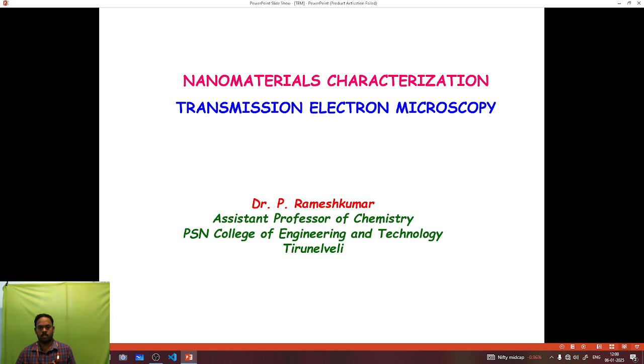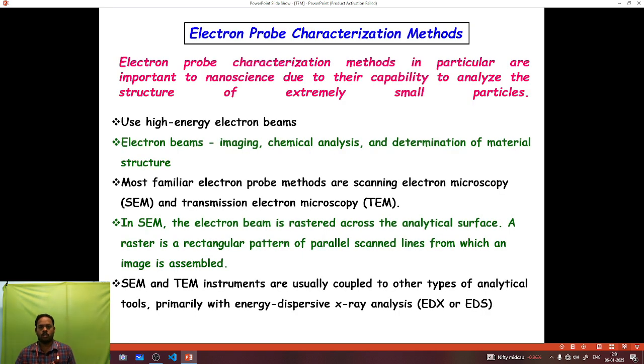So this is my second lecture on nanomaterials characterization. In my previous lecture, I explained scanning electron microscopy. Today I will mainly focus on transmission electron microscopy under nanomaterials characterization. Both scanning electron and transmission electron microscopic techniques come under the electron probe characterization methods.